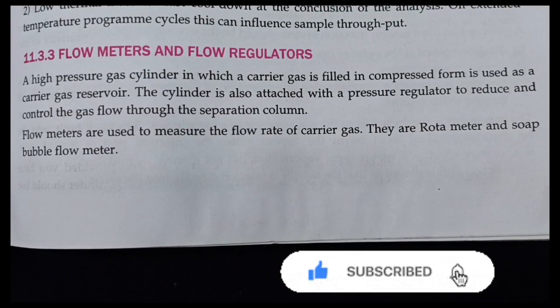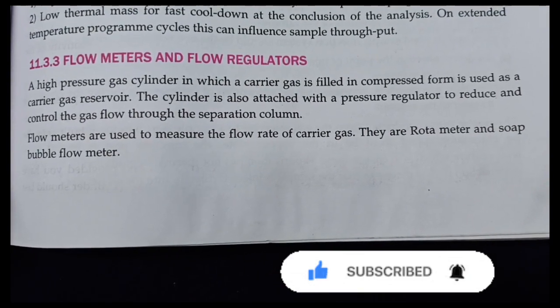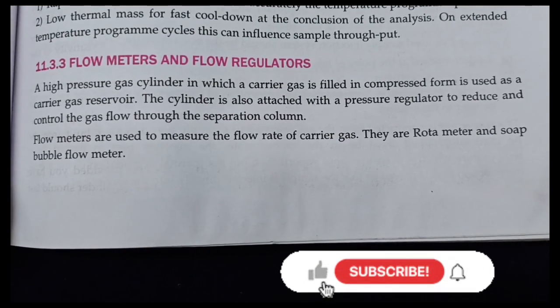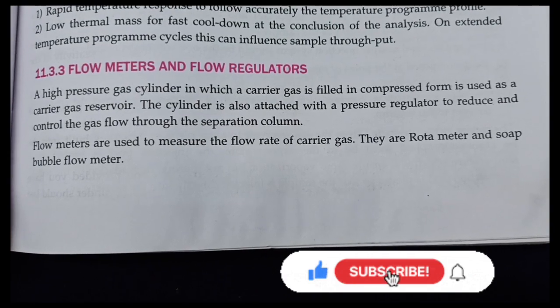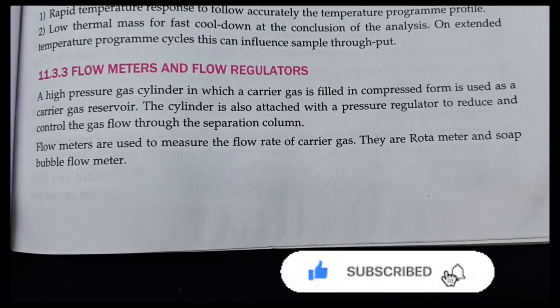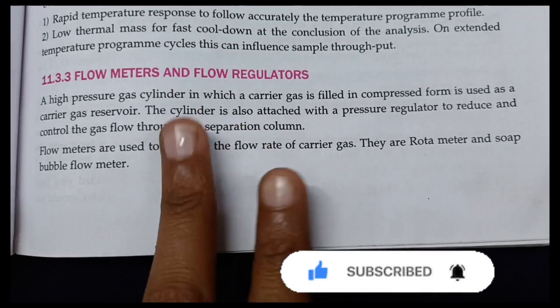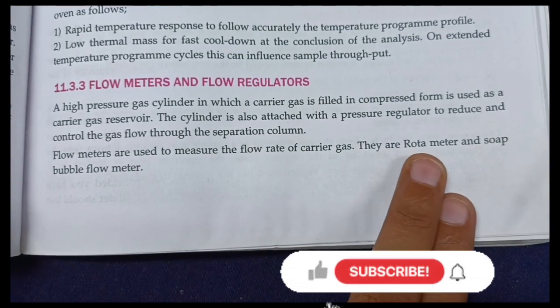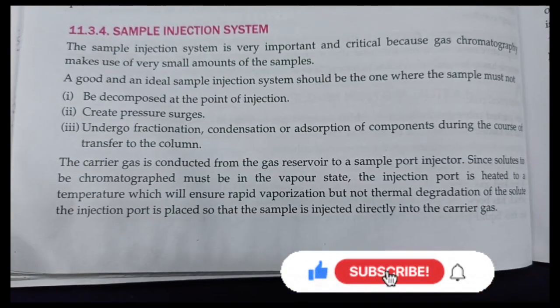Flow meter and flow regulator. A high pressure gas cylinder in which the carrier gas is filled in compressed form is used as a carrier reservoir. The cylinder is also attached with a pressure regulator to reduce and control the gas flow through the separation column. The flow meter is used to measure the flow rate of the carrier gas. They are the rotameter or the soap bubble flow meter.